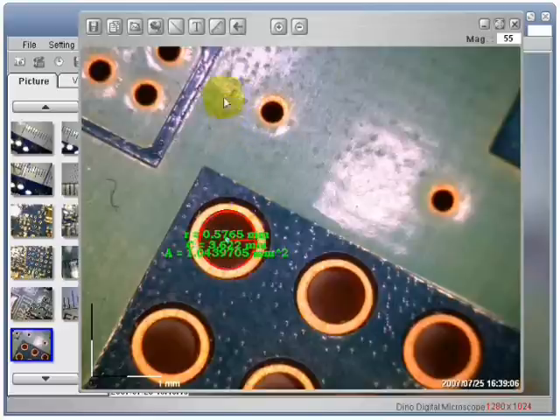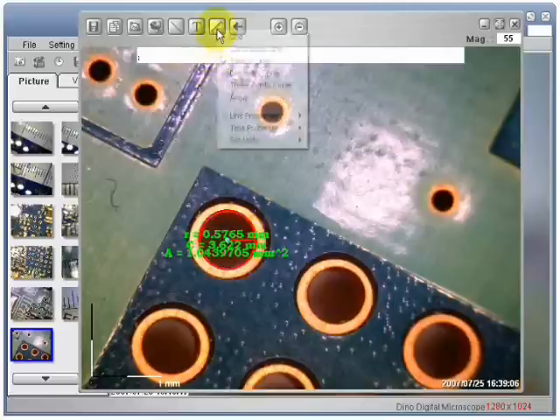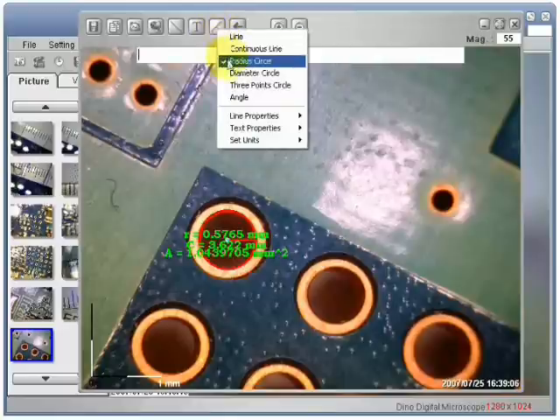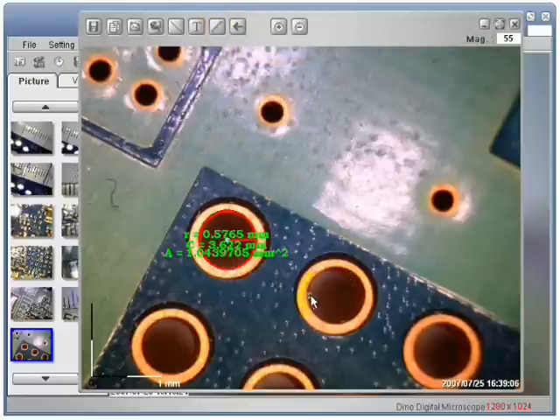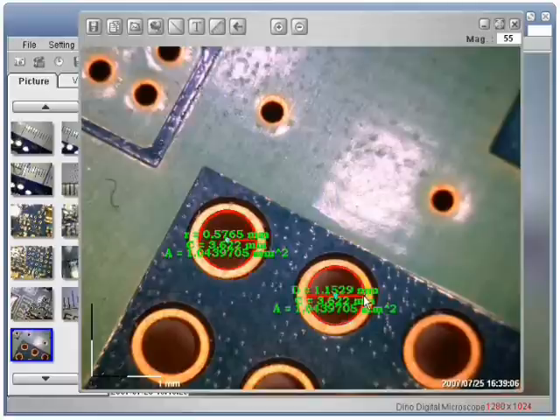Now I am going to choose to measure with the diameter of a circle. Left click one time to start. Left click one more time to finish.